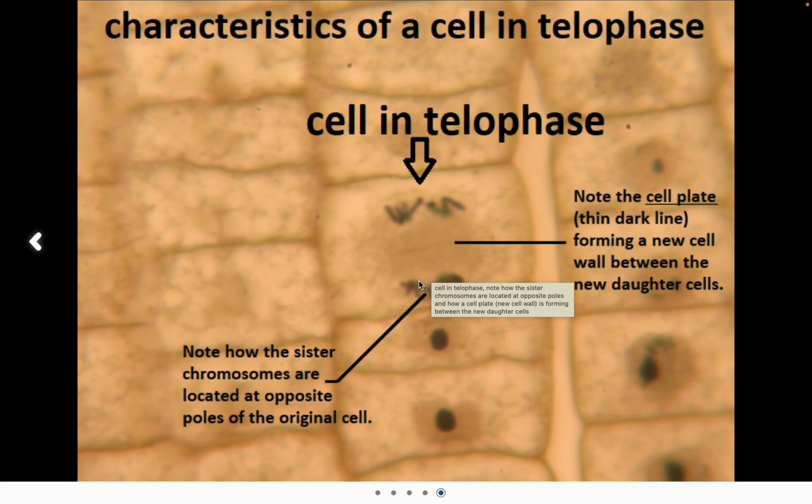So that final phase of telophase is sometimes you can see these, sometimes these are starting to unravel. Here you can still fairly clearly see those. The only reason why we might say this is telophase instead of anaphase is, number one, it's clear that they're completely separately on opposite poles, and secondly, that cell plate in the middle has started to form, which means that the anaphase must be over, and they're just sitting there waiting for the formation of the new nucleus, and then the formation of that new cell wall that will split it into two different cells.